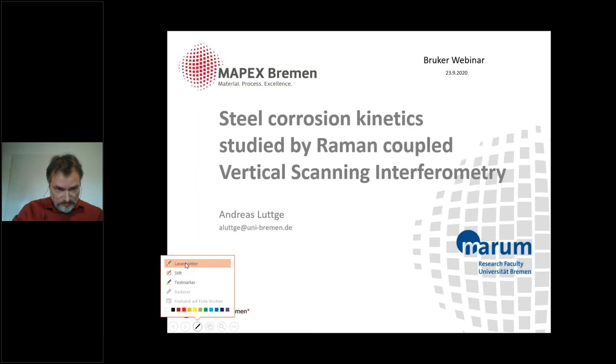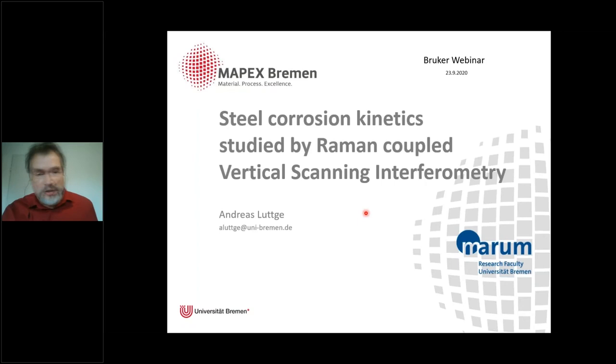So, hello, and thanks for the invitation and the opportunity to talk today about steel corrosion kinetics, studied by Raman-coupled vertical scanning interferometry. And I'm very excited about the first two talks. What I heard is kind of a dream coming true. We have worked the last, I think, more than 20 years now on utilizing vertical scanning interferometry for a number of different applications.